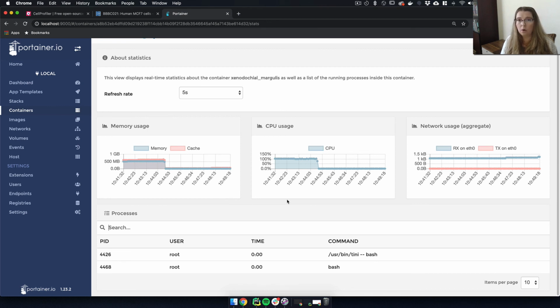So that is how you would go. You would take each one of your CellProfiler analyses and start to think about how you could batch it. What I like to do is take paper and pencil and draw out the steps in the analysis and figure out exactly where I could start to split things. And once I split them, do these steps depend upon each other? Can I parallelize them? So that's it for that.